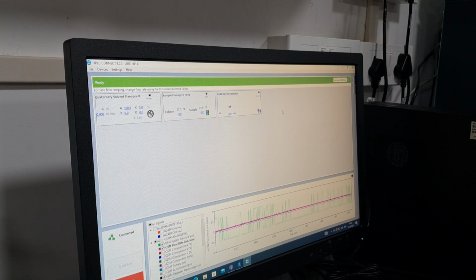We are going to give the set parameters in this. You cannot create a sequence, or do anything else actually. This is just a graphical presentation of the HPLC module. I will click on any of the modules, and an icon called Launch Console will come. Launch Console, yes, and it gets popped up.